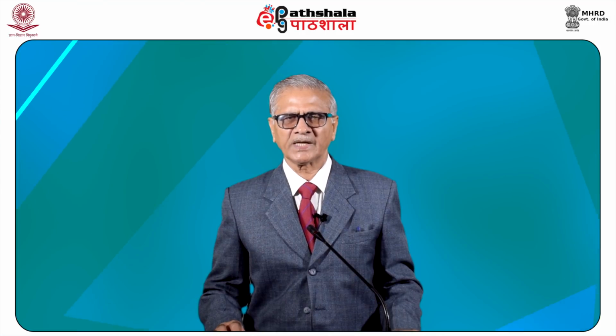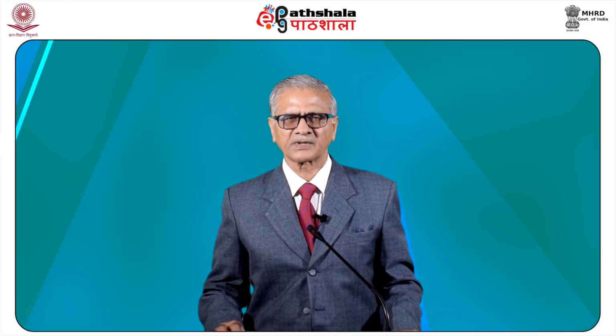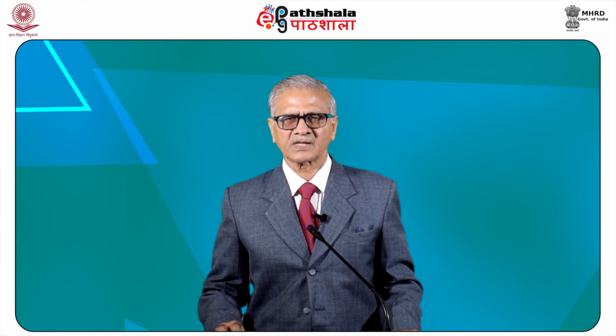Due to the ability of PCR to make millions of copies of a particular DNA sequence in just a few hours, it has revolutionized molecular biology. DNA amplification with PCR technology is sensitive, rapid and is not limited by DNA quality like other techniques such as RFLP, that is restriction fragment length polymorphism. It is well suited for forensic DNA sample analysis.